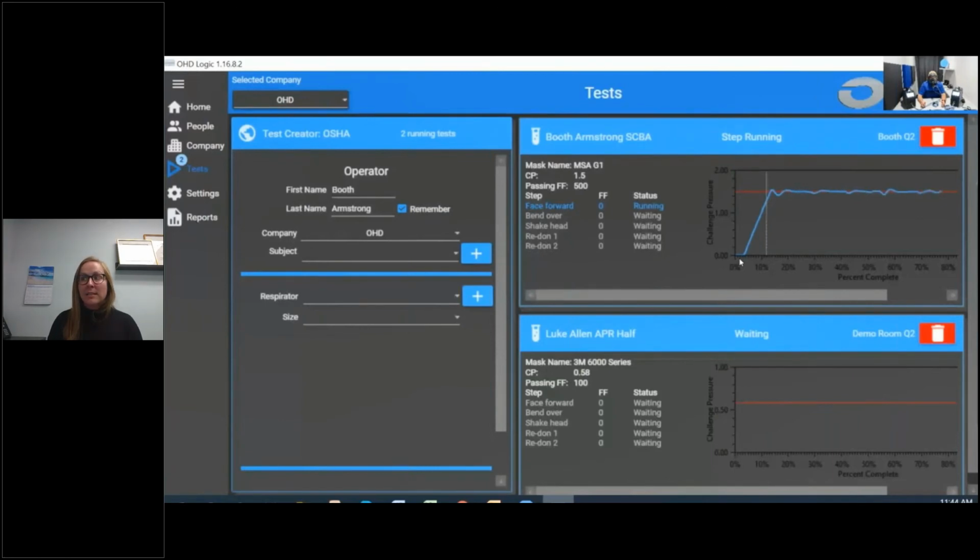Another thing was we actually discussed taking the report of the leak rate off of the Q2. But in a beta test that we sent out, people just like seeing that leak rate, like knowing exactly what it is. So we love the graph. We like seeing our leak rate. And that's just what we found with our customers.